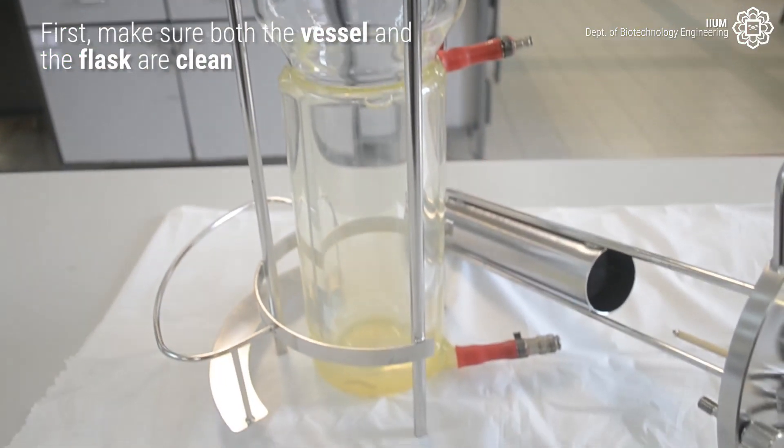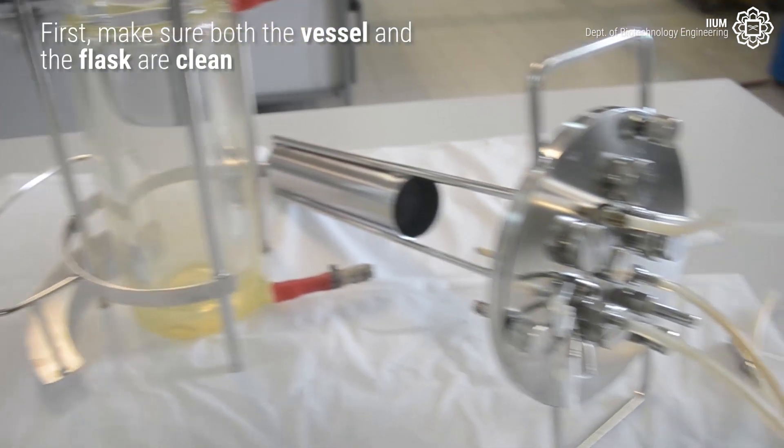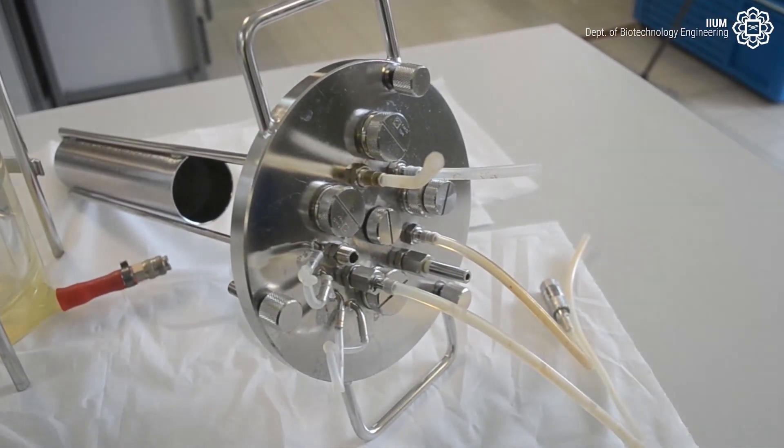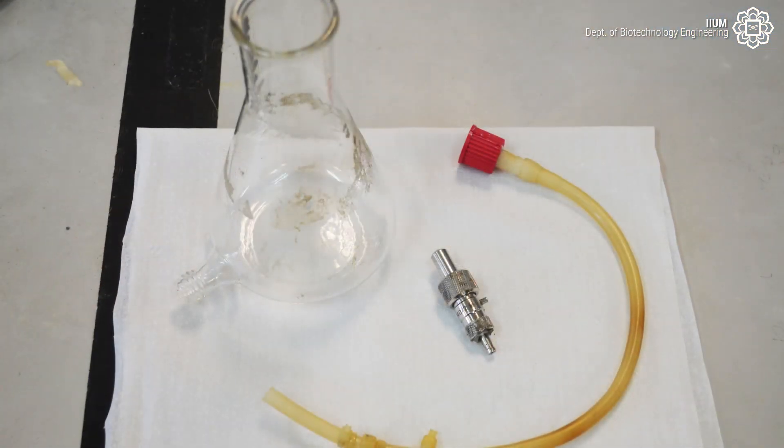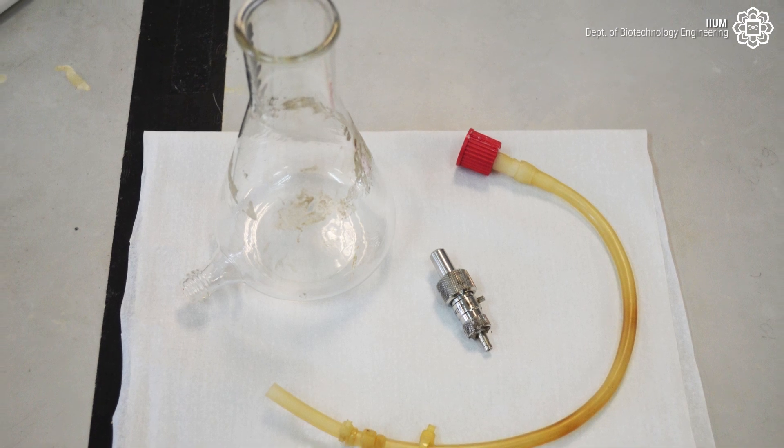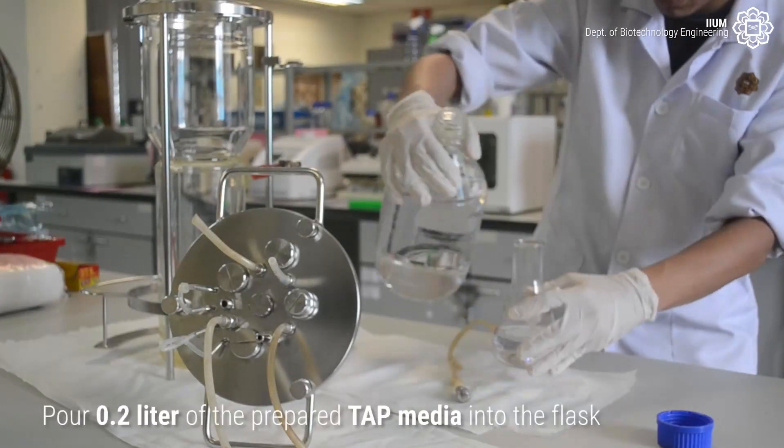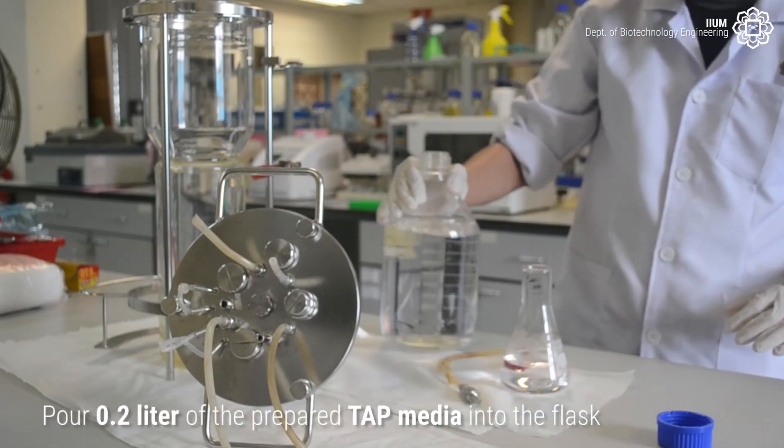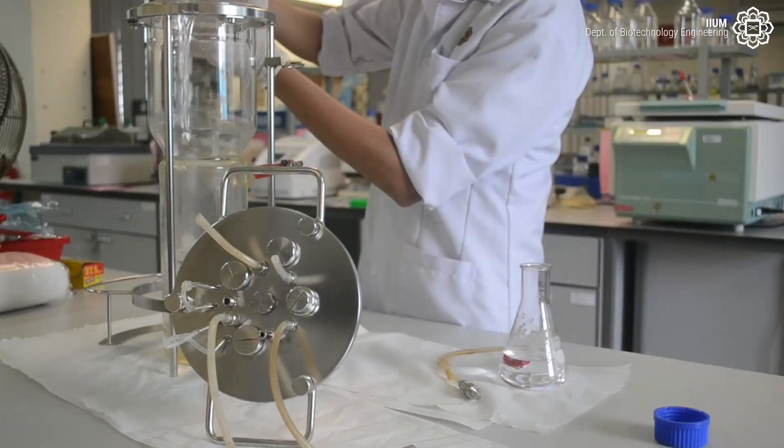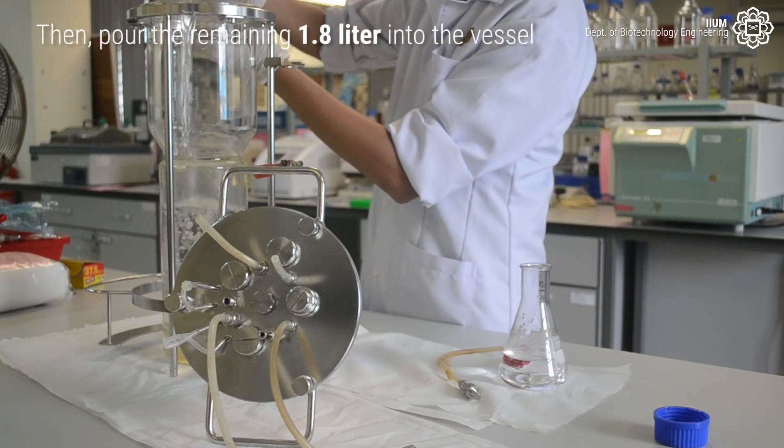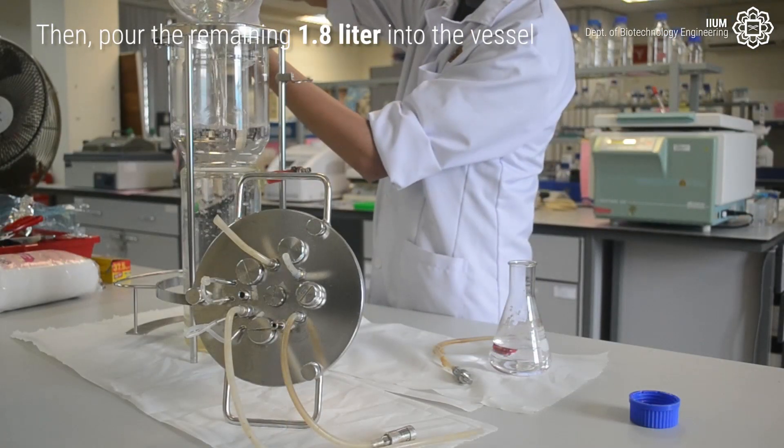First of all, make sure the vessel and the flask are clean. Pour 0.2 liters of the prepared tap media into the flask. Then pour the remaining 1.8 liters into the vessel.